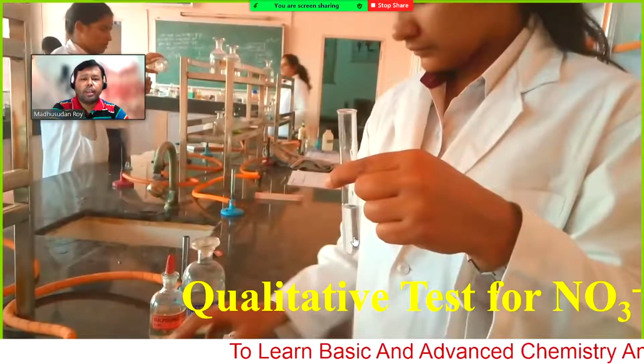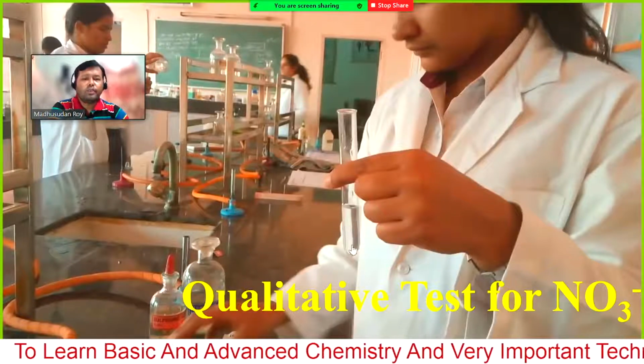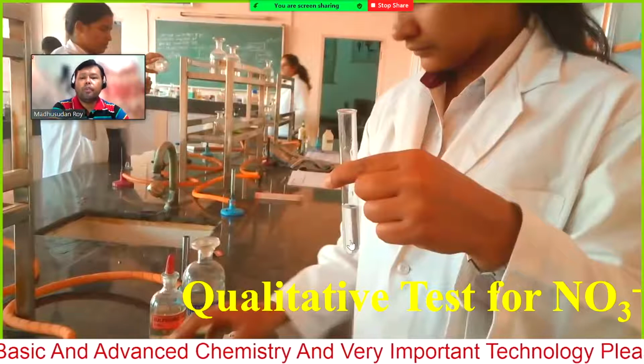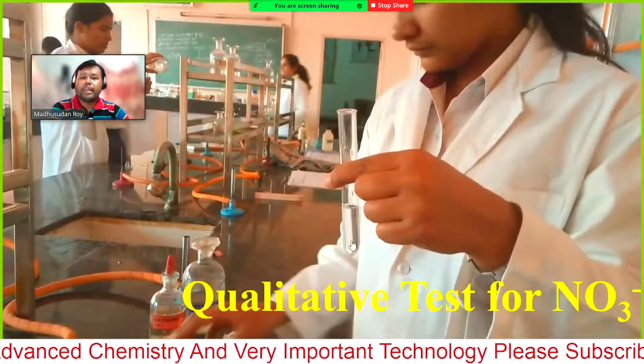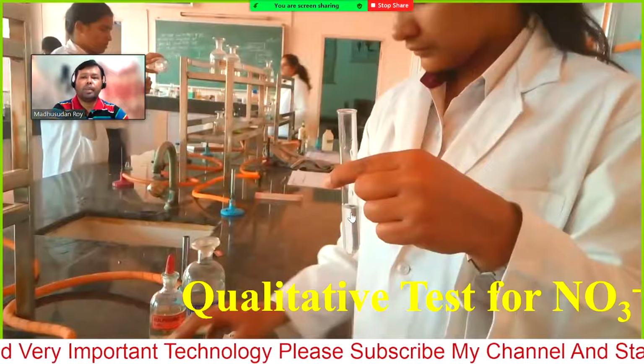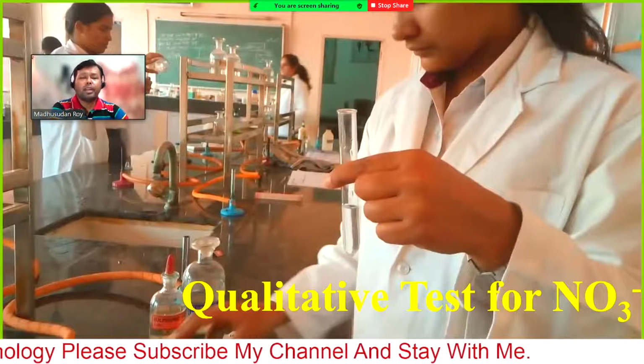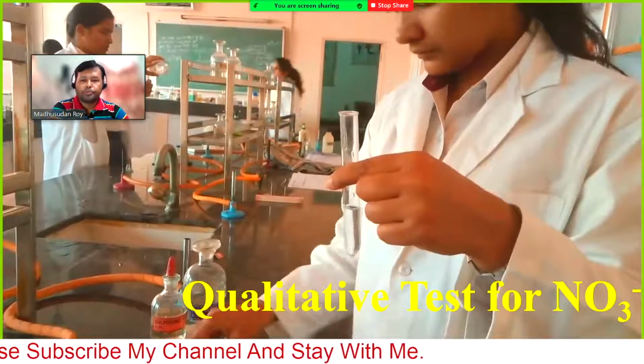Previously 1 ml, and then another 1 ml. Previously it was 1 ml of nitrate salt solution, that means the original solution, and then we added another 1 ml. It is approximate. You don't need to measure exactly, however approximately you can take equal volume.